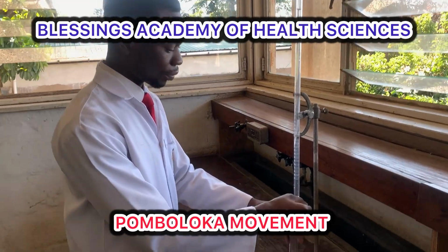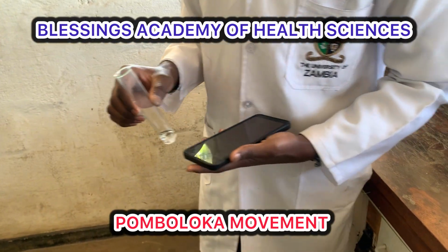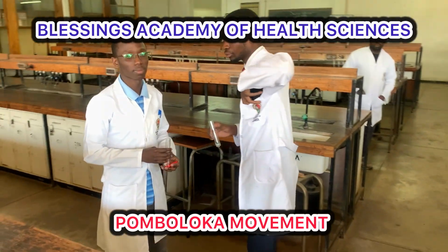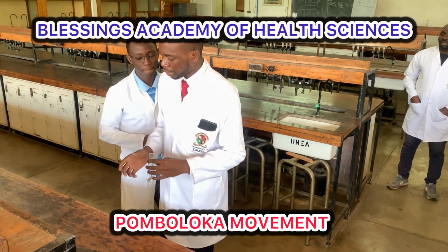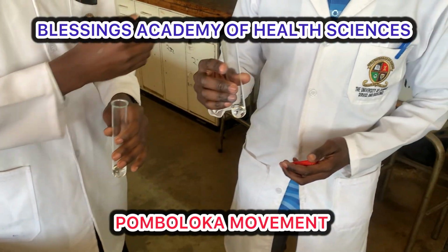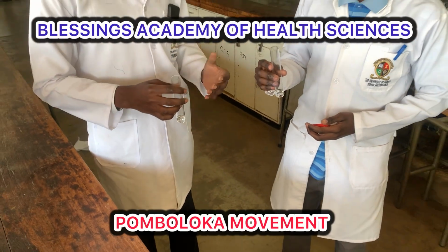Okay, so the 5 mils has already been collected. Second thing, the 5 mils of sample B has been collected. And remember, the first part was also collected, which is sample A. And what we're supposed to do here is mix them.